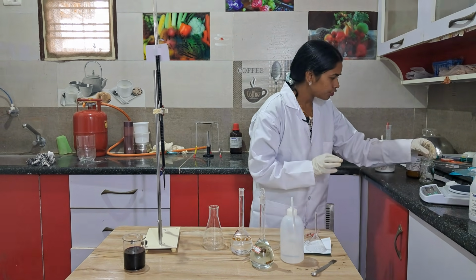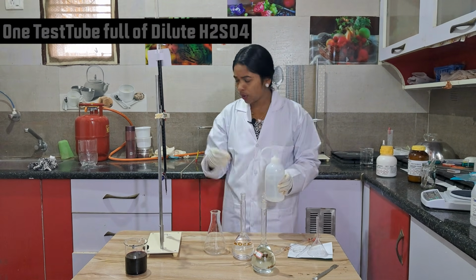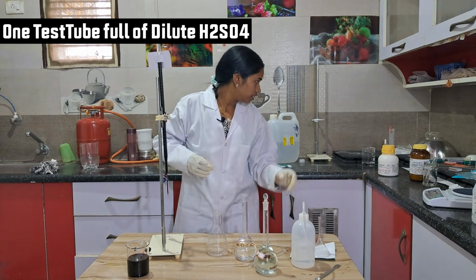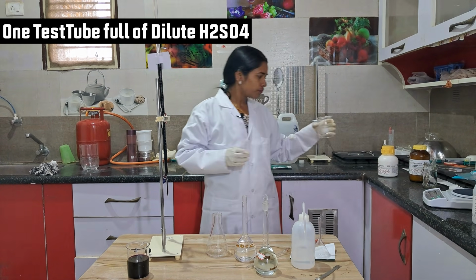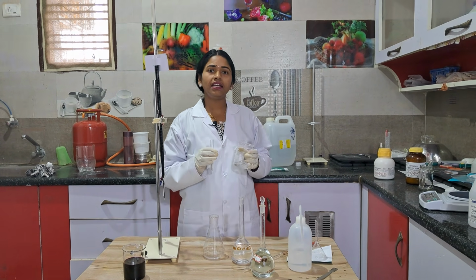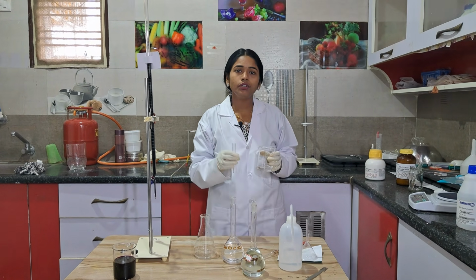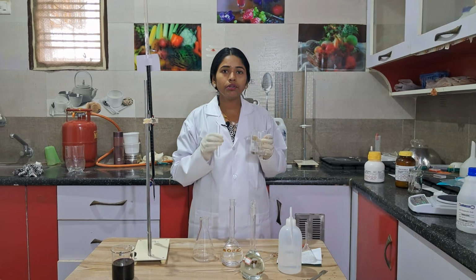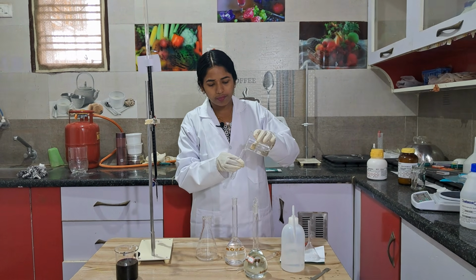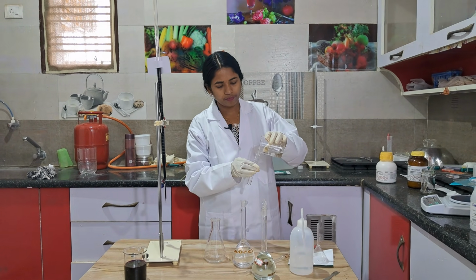See, this is my test tube. In this, I am going to add one test tube full of dilute H2SO4. This is dilute H2SO4. Usually in the laboratory, when we purchase, we purchase 98% concentrated sulfuric acid. We have to dilute it to 2 molar. I'll tell you how to dilute it during the calculation. Okay, observe this experiment.